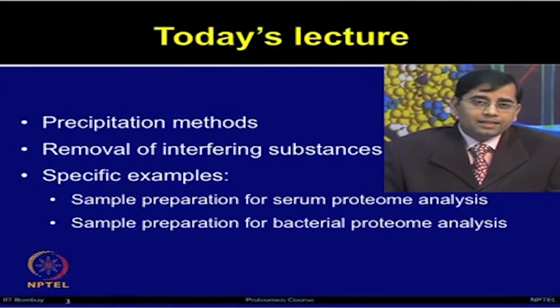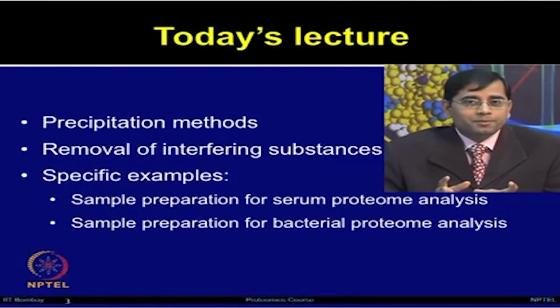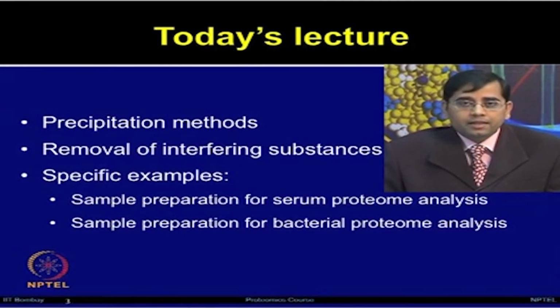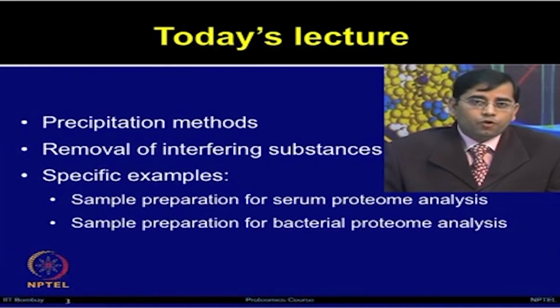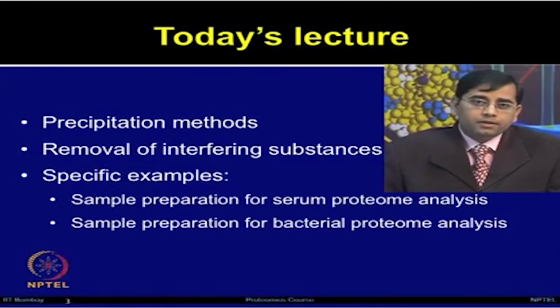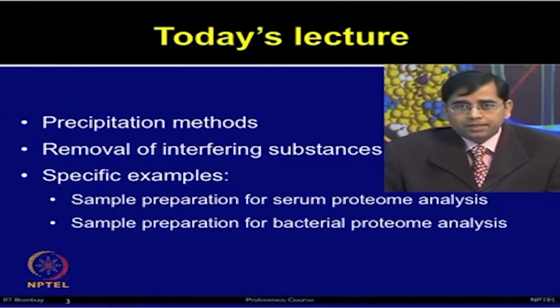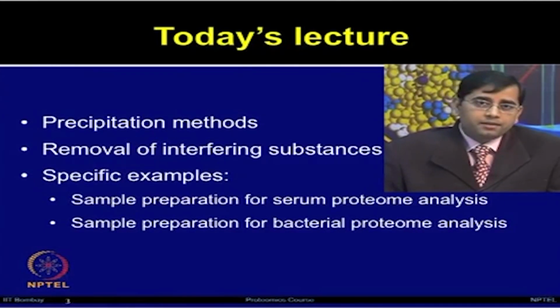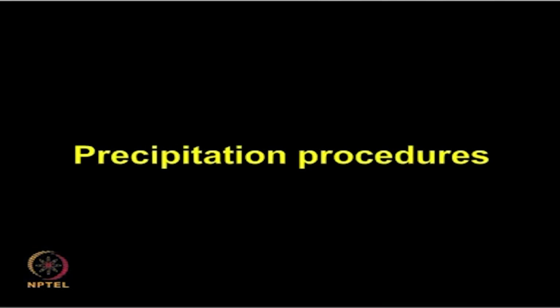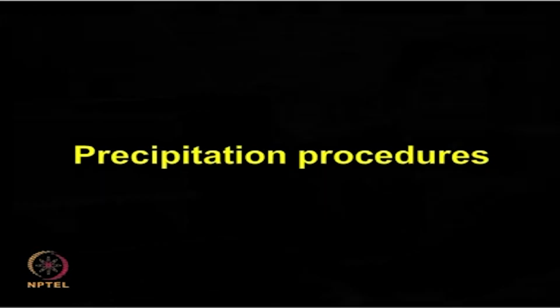Then you will realize that we need to integrate a lot of concepts which we have talked about in the previous lecture and today's lecture, and then we need to apply that for performing the proteome analysis of serum and bacteria. We will continue our specific examples in the following lecture, and then we will talk about the protein quantification. So, let us first talk about the precipitation procedures.